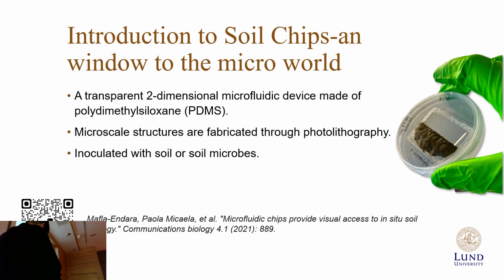We inoculate the soil samples here, and at the entries we allow them to migrate into the chips. Then we can observe them in real time to see how they interact with each other. You may wonder, how many of them will go in there? Our sequencing shows about 30 to 40% of the soil bacterial community manage to move in there. So that's considered a lot.